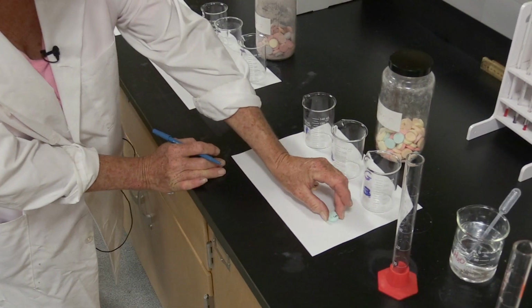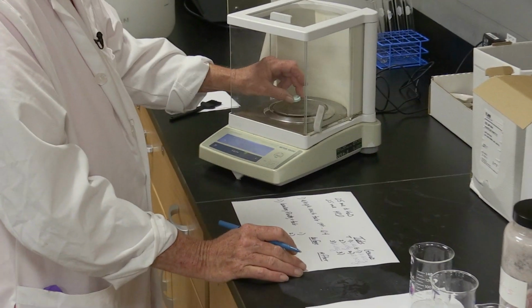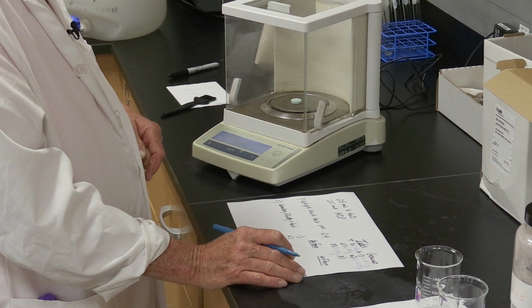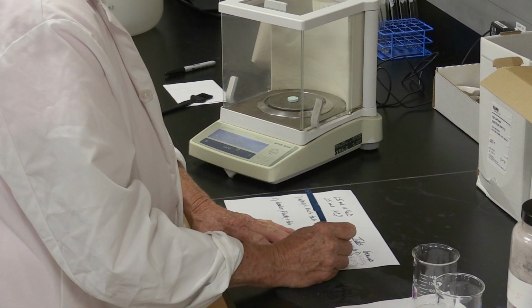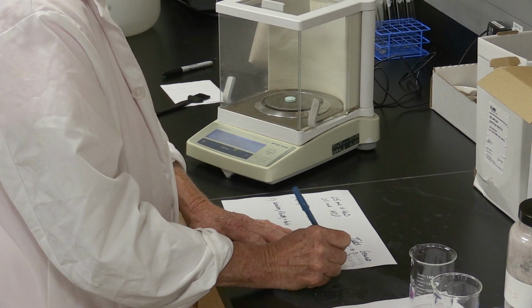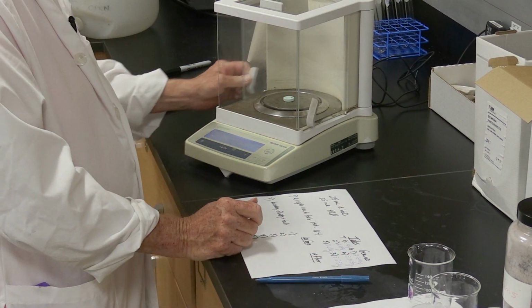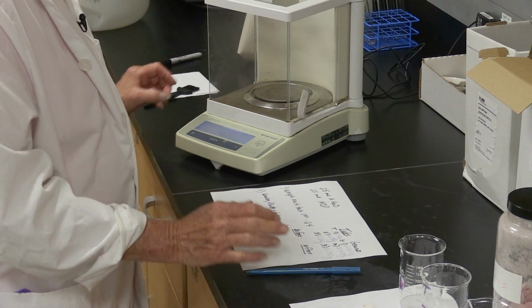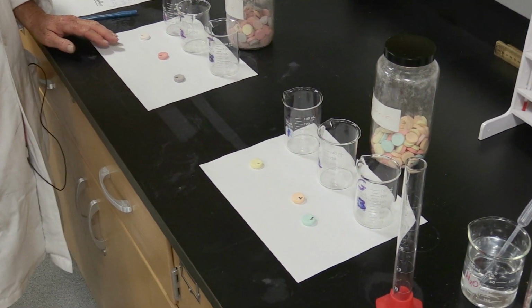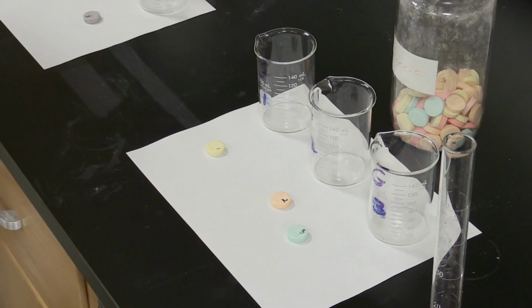And the last, or the third generic, 2.252 grams. All right, so the weight of these individual tabs are just for question number 4 at the back of your handout.